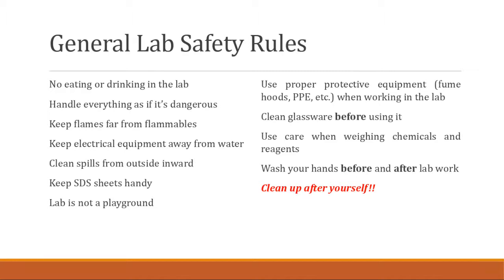General lab safety rules. You know, all of these bullet points on here are pretty much self-explanatory. We all know not to eat or drink in the lab because of all the things that could possibly happen. You're going to realize that if you're a fanatic and you love drinking water, well, what else is the color of water in the lab? Just about everything. Acetone, acids, bases, other solvents, ethanol. So you could always pick up the wrong bottle if somebody doesn't label it correctly.